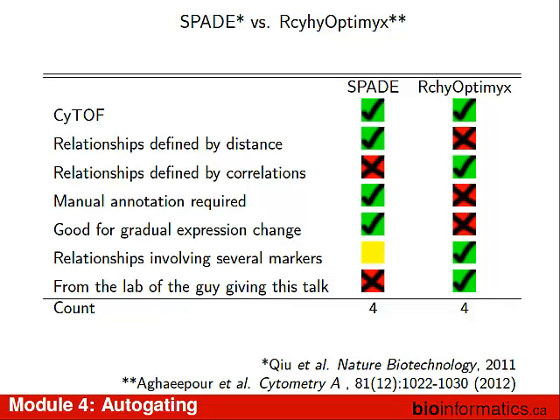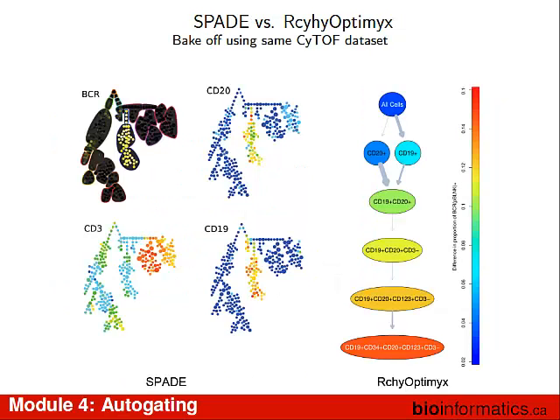So in SPADE, the spanning-tree one, it's described a lot in their paper. The mathematics behind that is the way they do their sampling and how they draw these blobs. It's how far apart they are. They're not really cell populations, it's a bit abstracted from that. The way these blobs are drawn is how far apart these clusters of dots are in high-dimensional space, and it's based on a distance kind of measure. We're splitting populations. I didn't want to do the math on SPADE, but we can do that if you want.